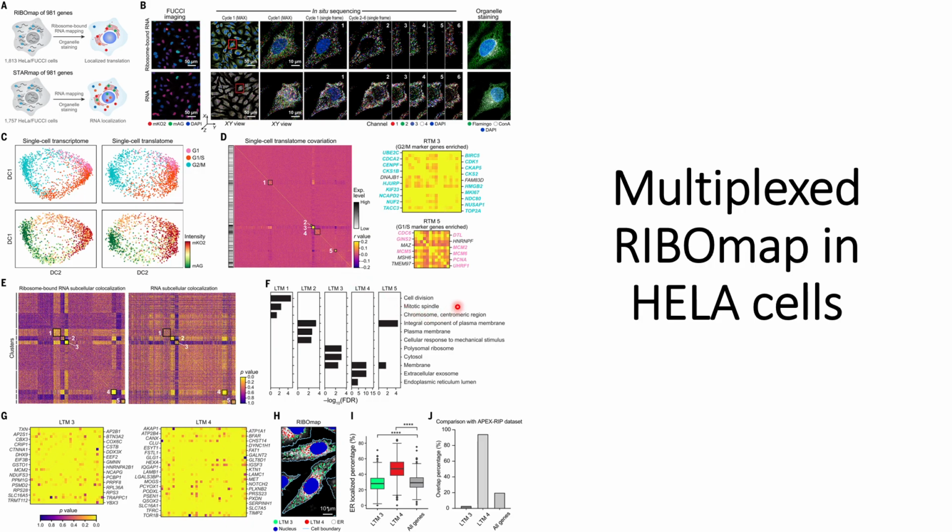From this we can make a prediction, or estimation, from this figure, that the majority of the translation of the genes occurs within the G1 and S phase. It is logically also correct, as in the G1 and S phase, cells are trying to grow and produce more proteins so that they can prepare themselves for the cell division stage.